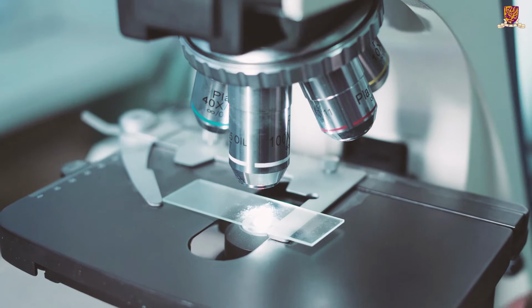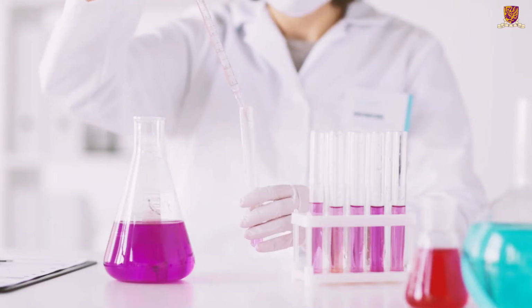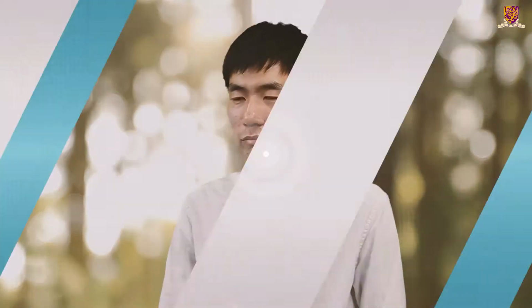Our lab works on developing novel optical microscopy techniques for various imaging applications. The work in our lab is very comprehensive. That involves understanding how light interacts with objects, building novel imaging instruments, performing image reconstruction, and post-processing. We work with material scientists, biologists, and doctors to promote our imaging techniques. Let me show you the optical microscopes in our lab.